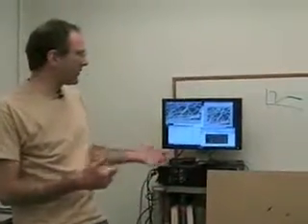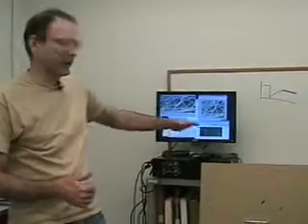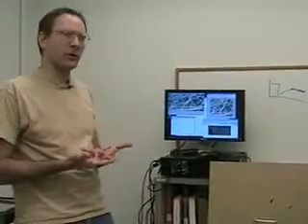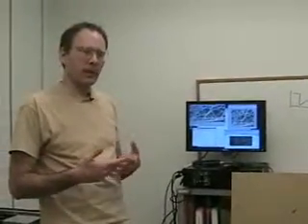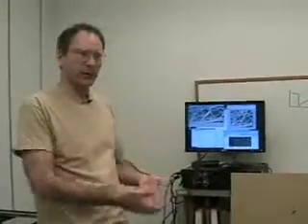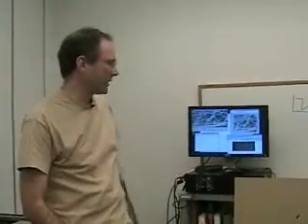And then if the image is still not particularly bright, what you want to do is start increasing the gain. And the gain is just multiplying your image by something, so it doesn't help your signal to noise at all. So you don't want to increase the gain first. You want to increase the shutter time first, because it will give you as good signal to noise as you're going to get from the sample with the illumination you have. Then increase gain just to scale it as close to saturation as you can get.